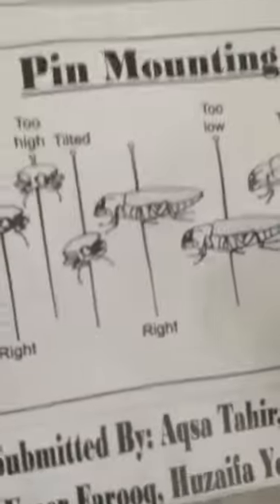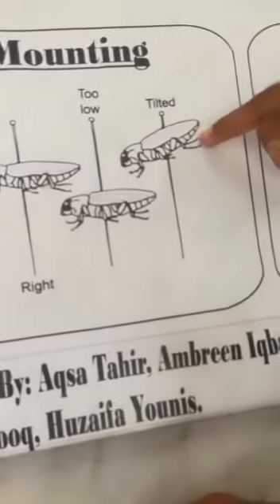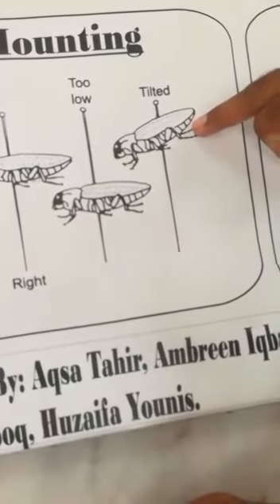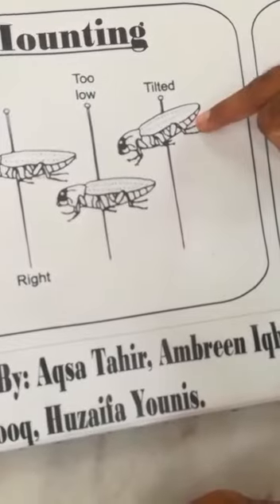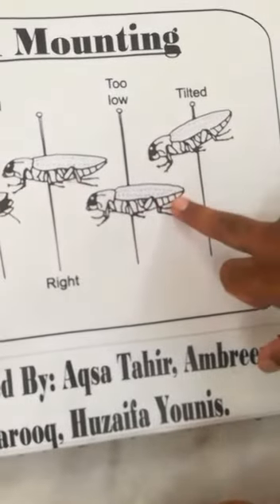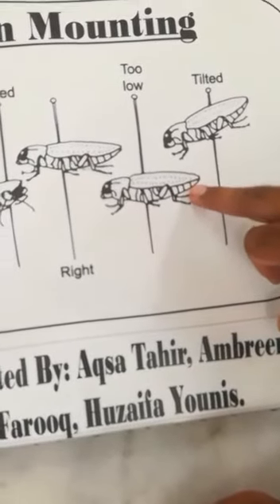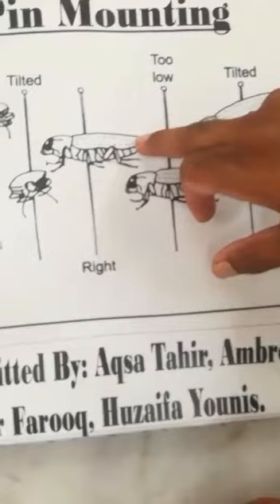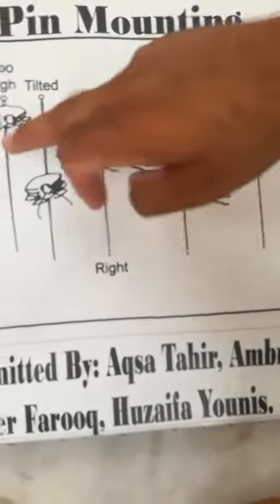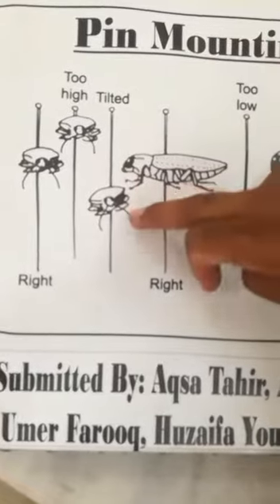This is an example of pin mounting. As you can see, this one is tilted — that is not correct pin mounting. This pin insect is too low, which is also not good pin mounting. And this one is at the right height. This one is also right. But this one is too high, and this one is tilted.